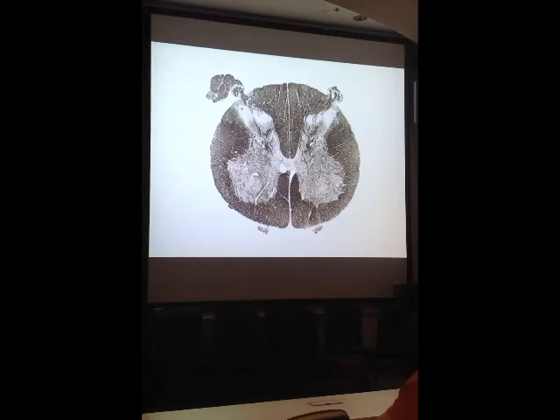Now here, in this dorsal part of the cord, what fiber tract, what ascending pathway structure dominates this area through here? Fasciculus gracilis. And are those axons that make up fasciculus gracilis axons of primary sensory neurons or secondary sensory neurons?